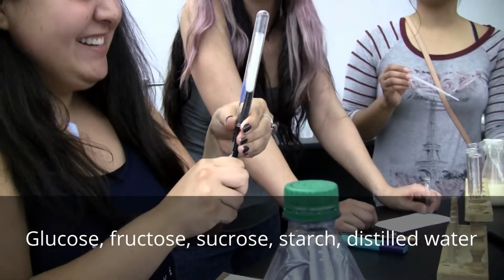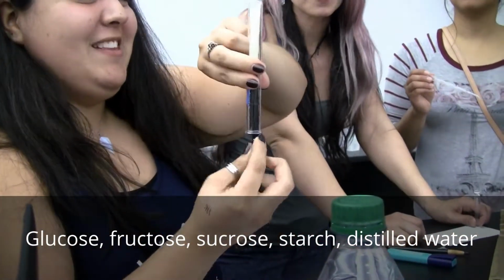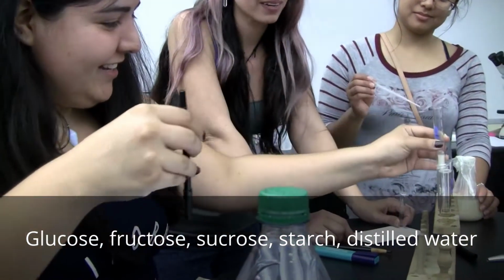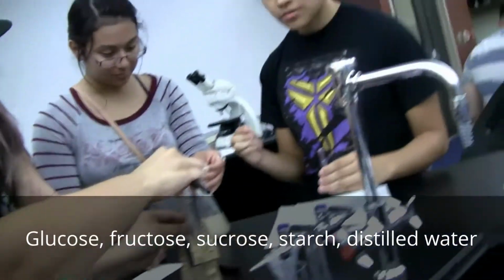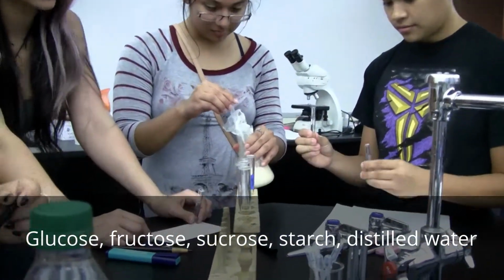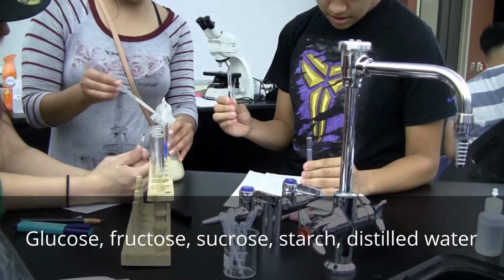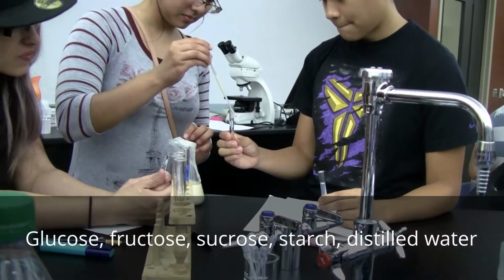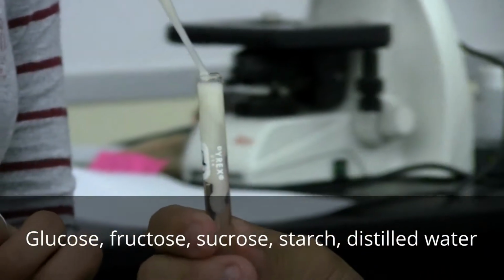The suspense. I have a big Sharpie if you want to use it. The pen's okay. It's kind of got this base to it that holds it. Okay. Here's the sucrose solution. That one's going to have a really weird reaction, right? It's sucrose and yeast because it's the sugar molecule. It's also filled a little bit more.